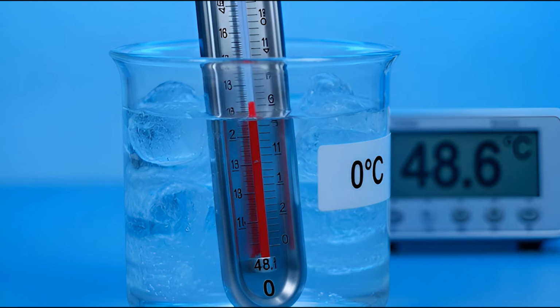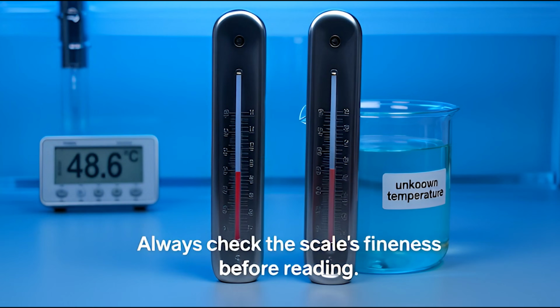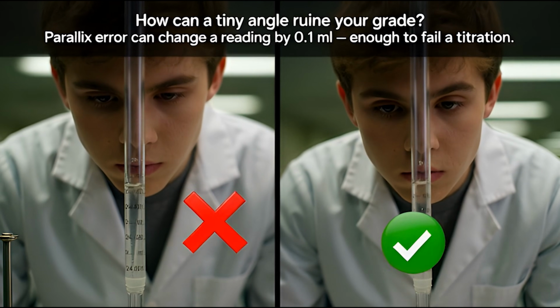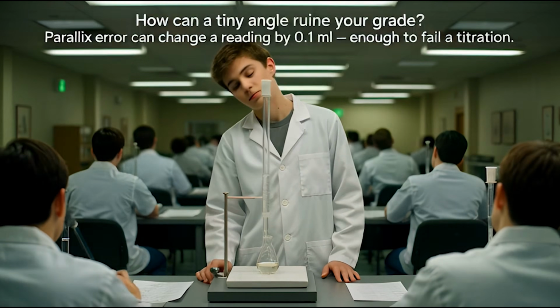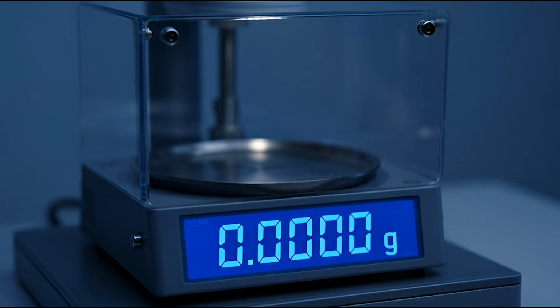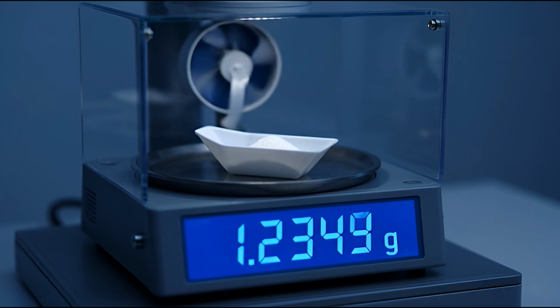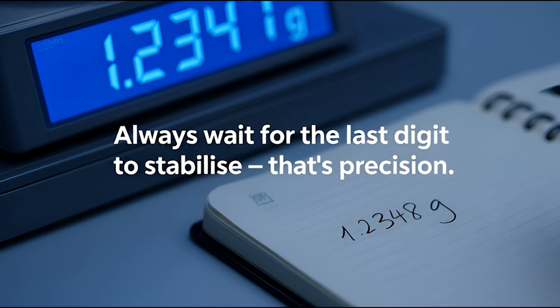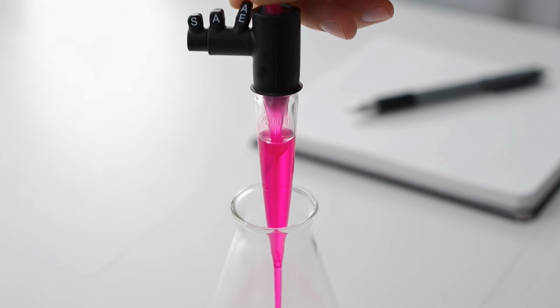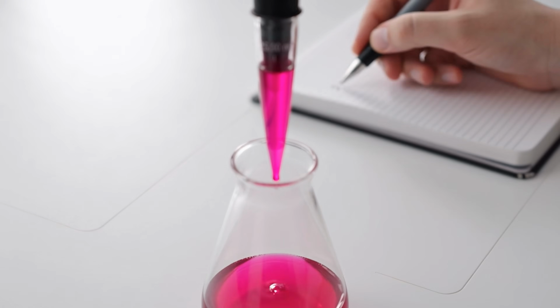Different thermometers, different rules. Check the scale, then decide, half division or nearest line. Parallax error, avoid it by reading at eye level every single time. 1 degree off and your result is wrong. Digital balance, close the draft shield, wait for the last digit to stop flickering. Patience, precision. Volumetric pipette, fill to the mark, drain naturally, touch the tip to the wall. Never blow out the last drop.